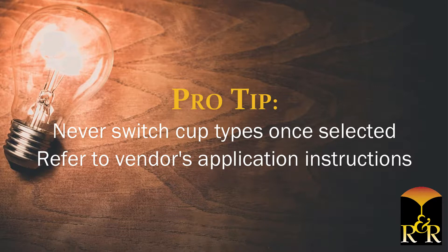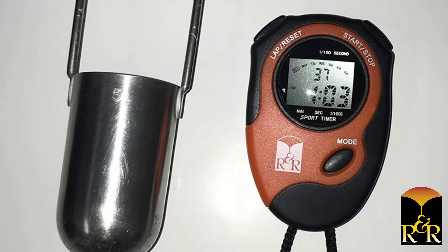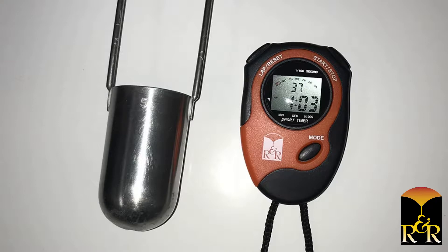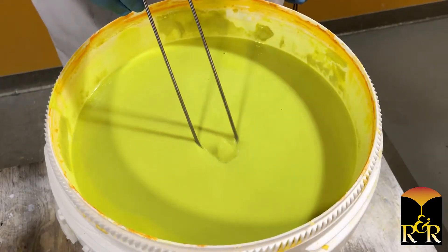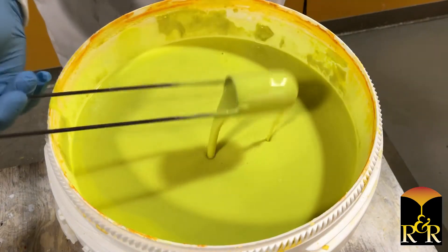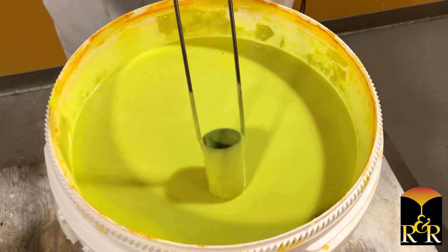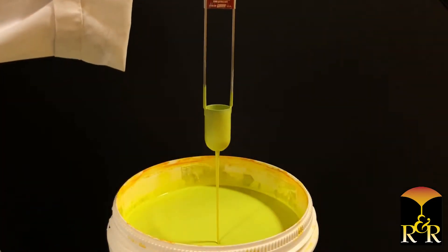Refer to the vendor's application instructions when selecting a cup. To begin the measurement, ensure that the cup is completely clean and dry. With the stopwatch in hand, submerge the cup into the slurry so the entire cup is covered in slurry. Pour the slurry out — at this point the cup should be completely coated with slurry. Re-submerge the cup into the slurry and pull it straight up and out of the slurry.